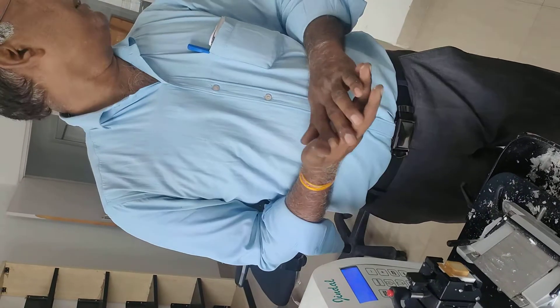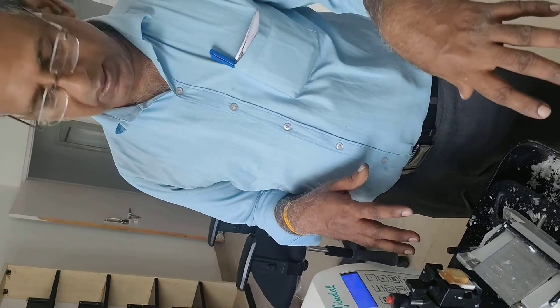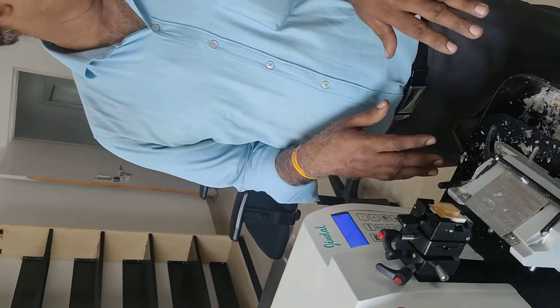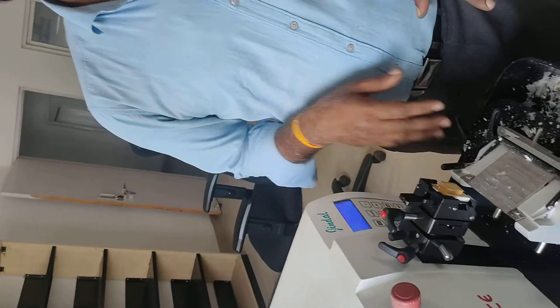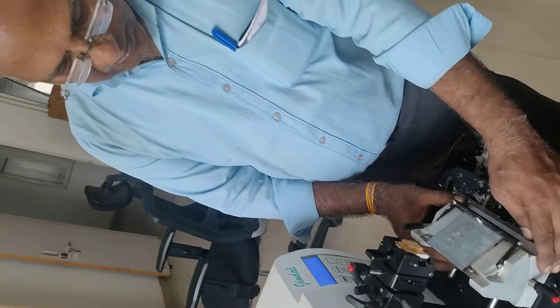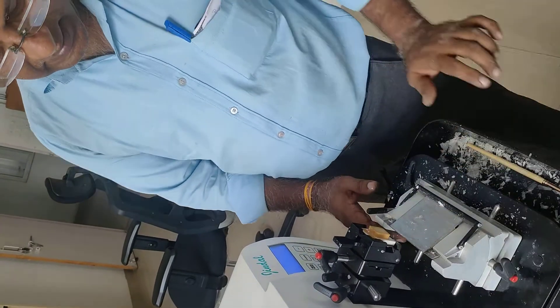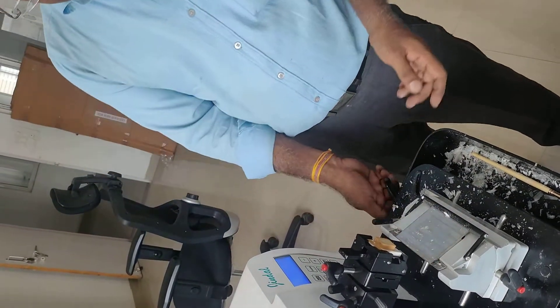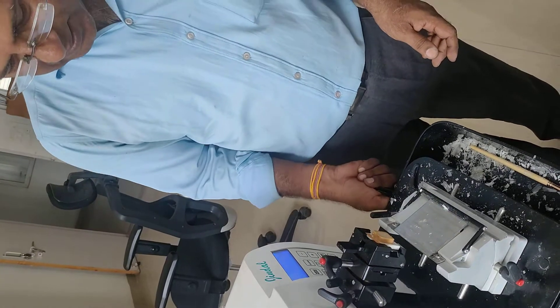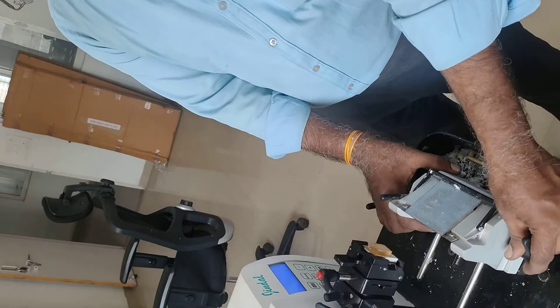We have to trim it on the eyes. I have to put it on the medicine center. It is dry. This block is dry. Now you have to set the subject here. The whole assembly has to clean the subject. Then we have to trim it on the right hand side.